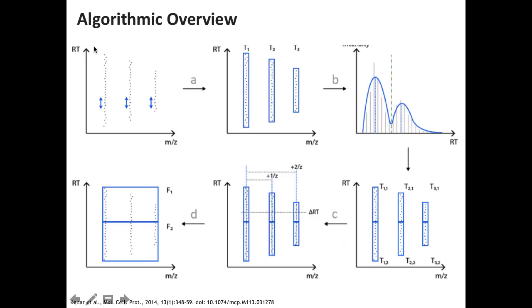The way this is done is that we are looking for mass traces by starting again at high intensity peaks and then working our way down. I will introduce that algorithm in a minute. It's based on a Gaussian kernel density estimator. These mass traces are basically just collections of peaks at this point. So we just say in this spectrum, all the peaks that are in this range, in these spectra going from here to there, that's one mass trace.